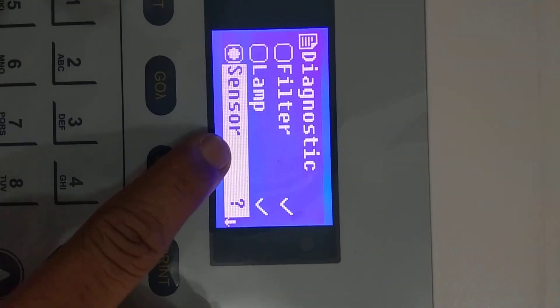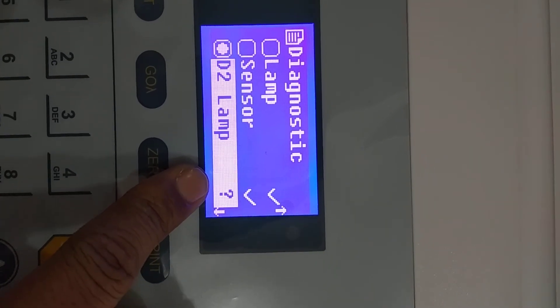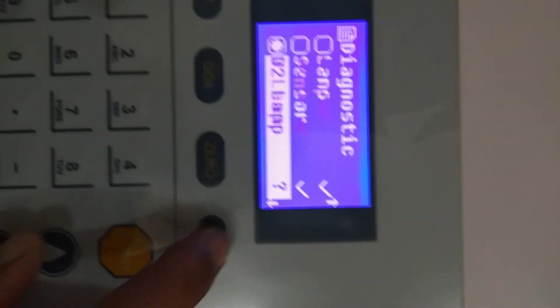The system will now automatically check all system settings. If any problem is detected, the tick marks will be replaced with a cross mark. Let it complete.